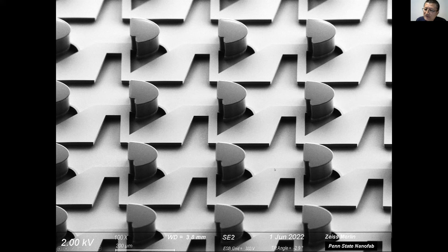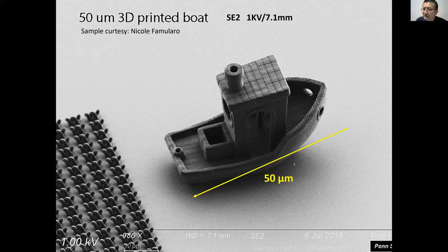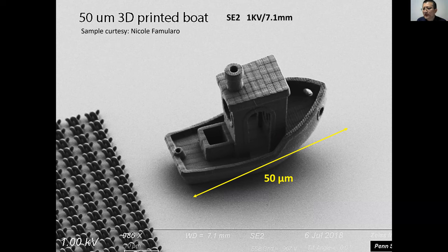Here's a 3D printed little boat, about 50 microns big. For this picture I use a very large working distance of 7mm — very far. Why? Sometimes if you want to see a larger feature, you have to move your sample far away in order to see the whole thing. That's why I'm using a large working distance.